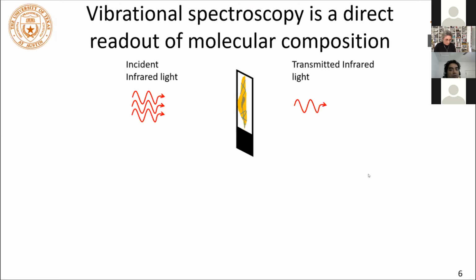And then we do UV-vis to see where those states are. So you can do the equivalent for vibrational spectroscopy as well. You move the incident wavelengths from the visible and the UV to the infrared, because infrared has energies that are resonant with the vibrations of these atoms relative to one another. The bonded nuclei are vibrating. That's what you're probing, and infrared light has the right energy to probe those vibrations.